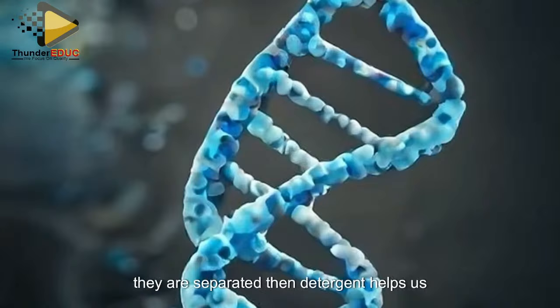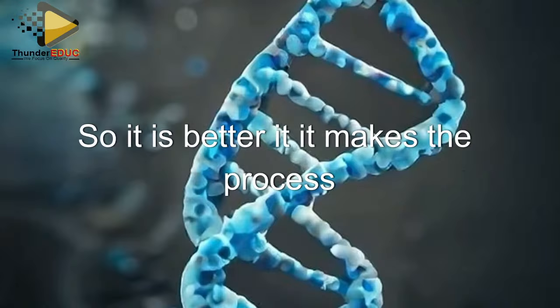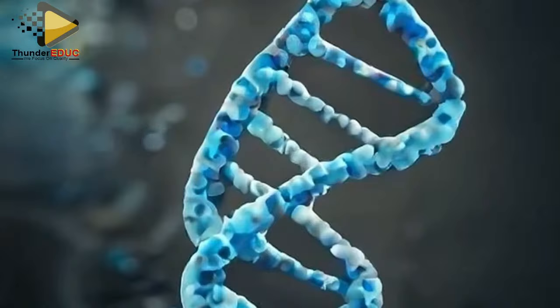Then detergent helps us to dissolve the phospholipids in the cell and the nuclear membrane, which break down. When the nuclear membrane and the cell membrane break down, this facilitates the extraction of DNA from the nucleus and the cell. Yeah, so it makes the process of DNA extraction faster.